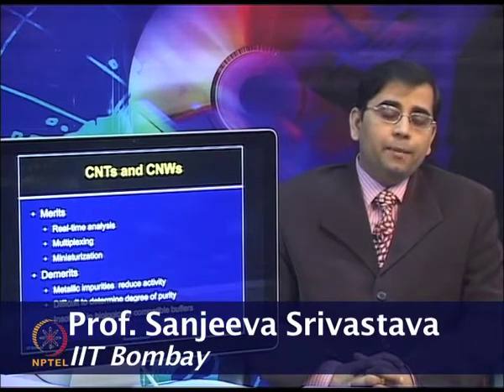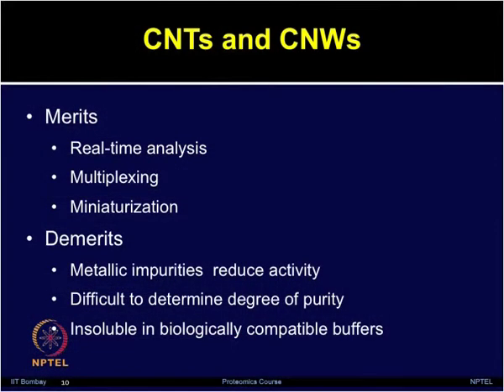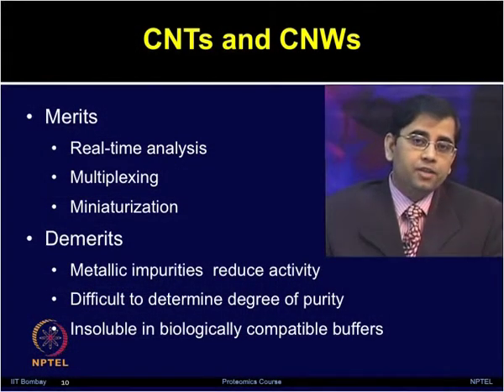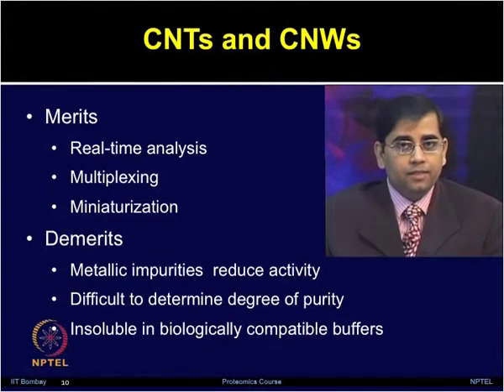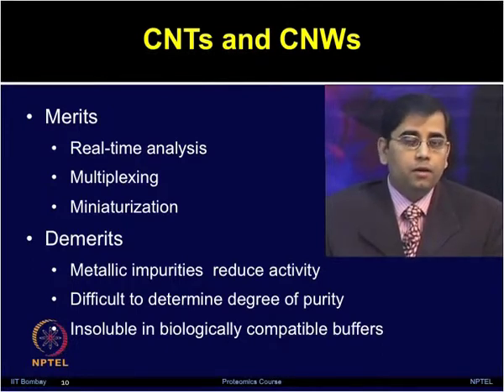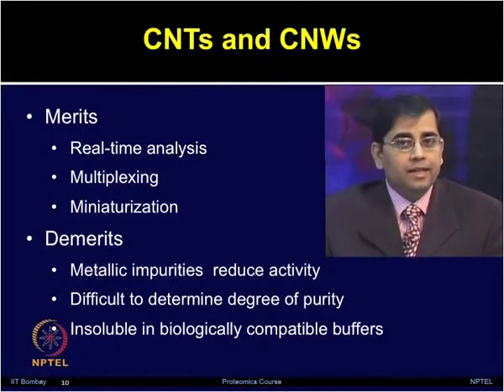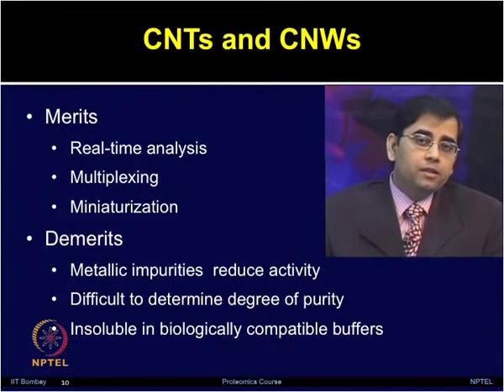They allow real time analysis similar to what we talked about with some of the previous label free techniques including SPR, where we have the opportunity to monitor the reaction in real time, which is not the case with the label based detection techniques, which are mostly endpoint assays. Here, we can monitor how reactions are changing, and one can actually change the experimental condition in real time to modify the binding. This also provides the multiplexing capability and gives miniaturization.